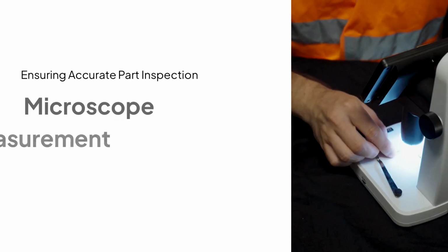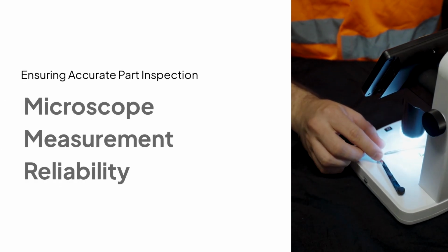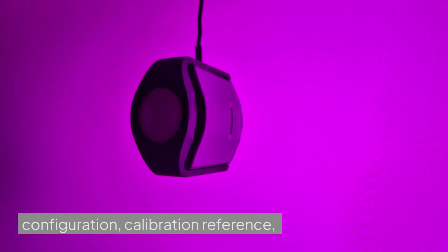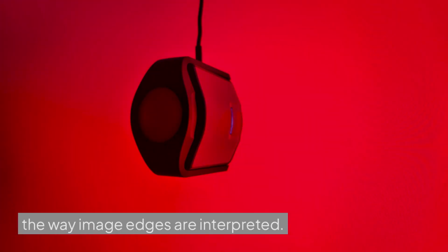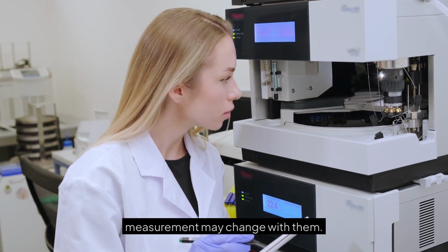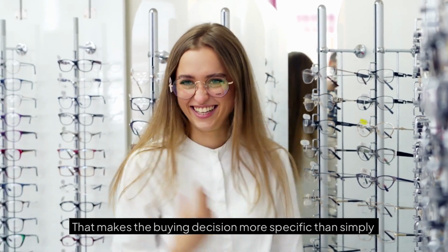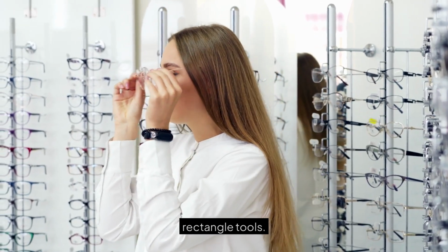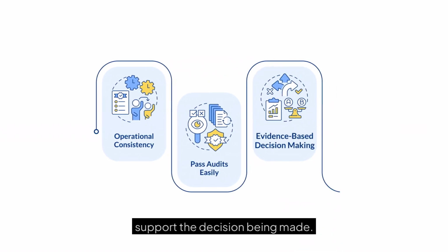A measurement displayed on a microscope screen is not automatically proof that an incoming part conforms. The result depends on the optical configuration, calibration reference, software settings, operator choices, and the way image edges are interpreted. Change any of those conditions, and the reliability of the measurement may change with them. That makes the buying decision more specific than simply choosing a camera with distance, angle, circle, or rectangle tools. The real question is whether the proposed workflow can support the decision being made.